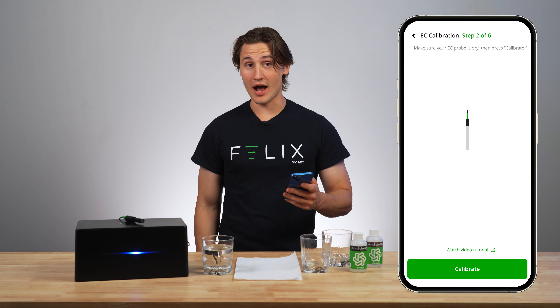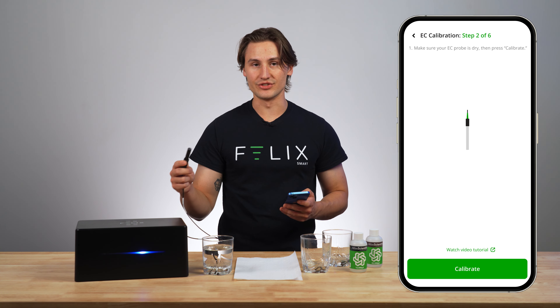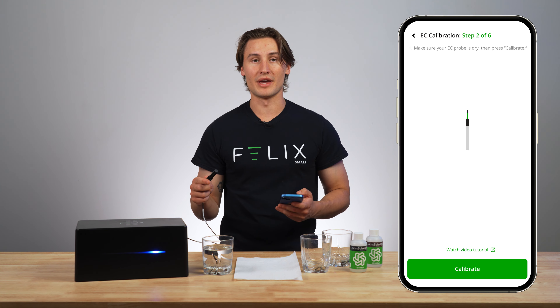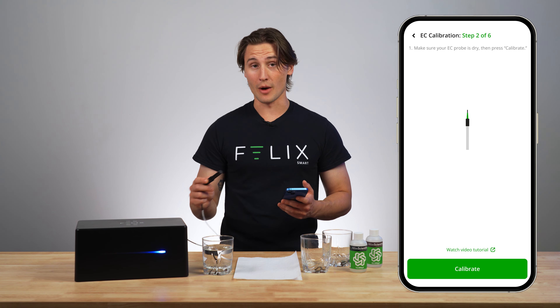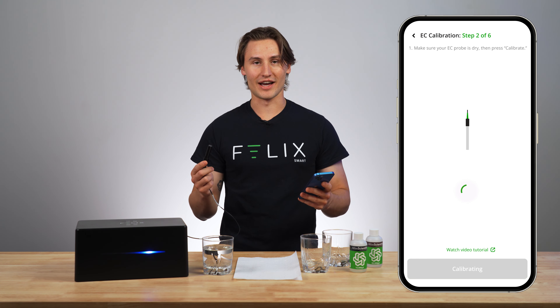Make sure your EC probe is dry, then press calibrate. Mine has not touched any liquid — it is completely dry — but if you're taking yours out of an aquarium or any water source, you're going to want to make sure to properly dry it off. Not just tap it on some paper towel — properly dry it off. So I'm just going to press calibrate and wait patiently for that to go through.